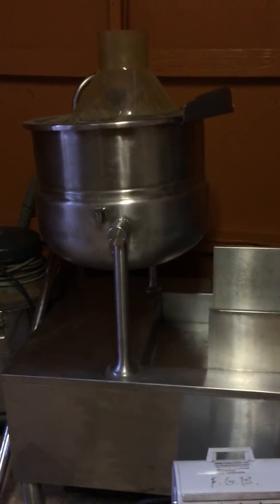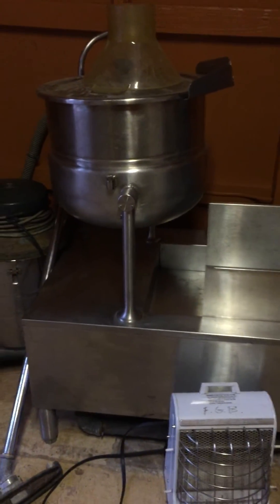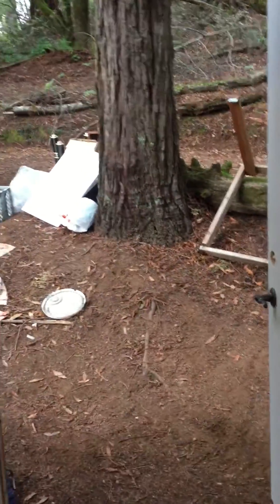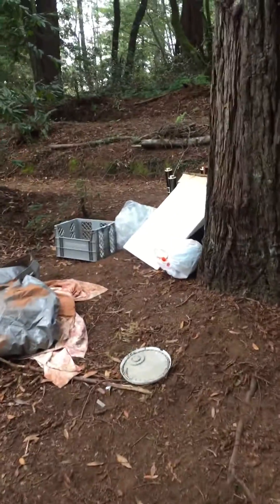We have a whole system here — a sink over here, this has its own water. We're gonna try to recycle all of our gray water from this into a holding tank and then use it in our garden, which is kind of out by where we're setting up our lab.